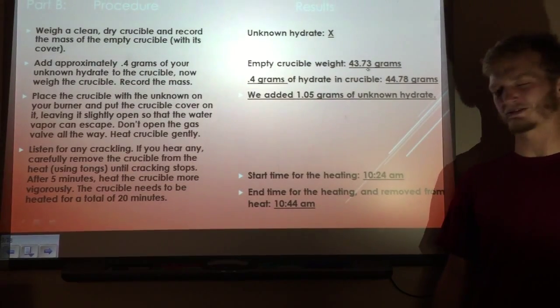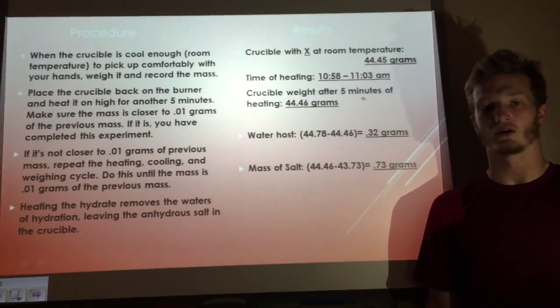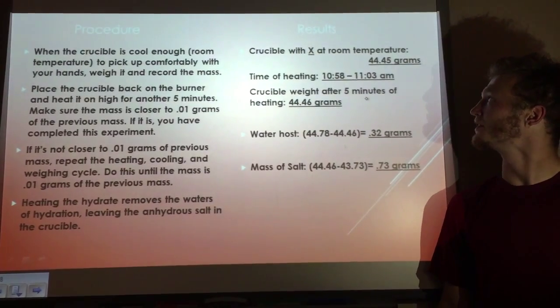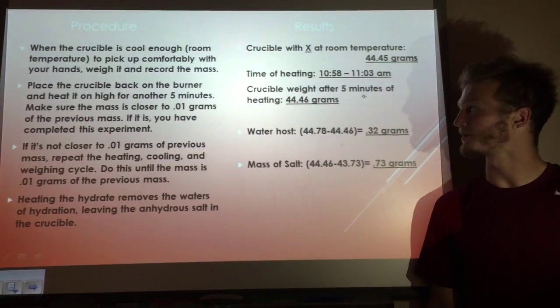We started at 10:24 a.m. and the end time was 10:44 a.m. When the crucible is cool enough at room temperature, pick it up comfortably with your hands, weigh it, and record the mass. At room temperature, our crucible weighed 44.45 grams.